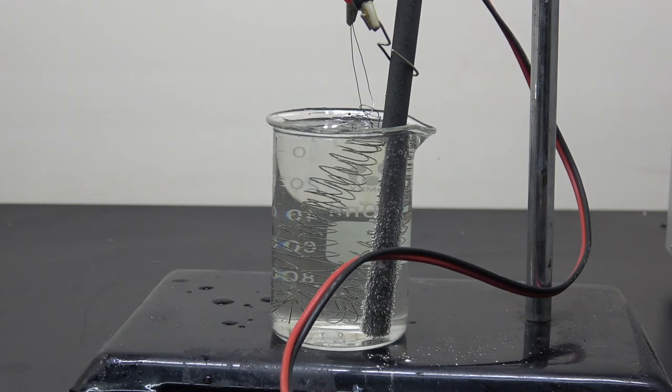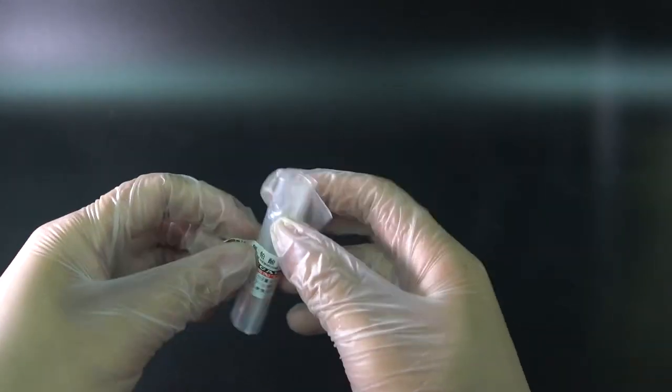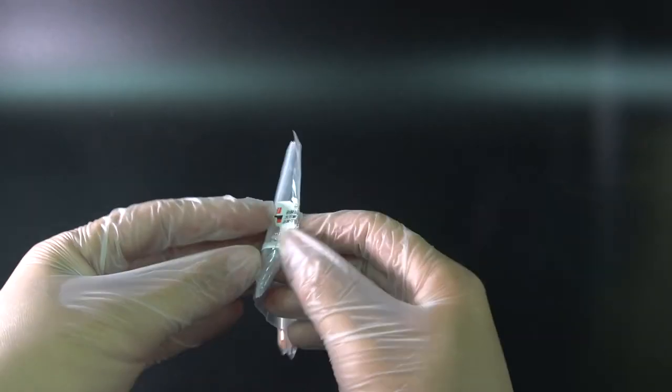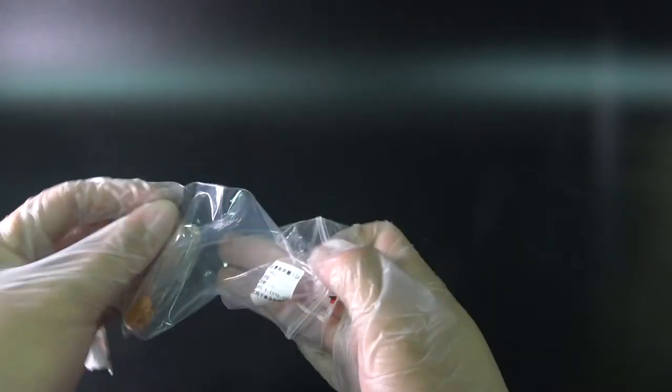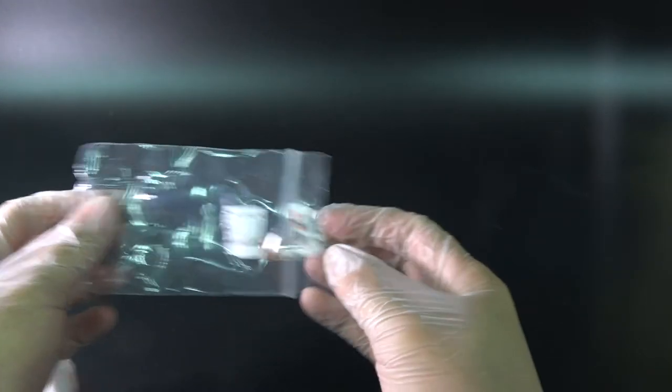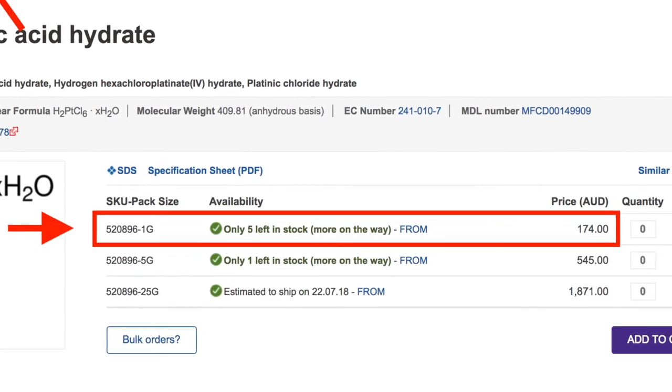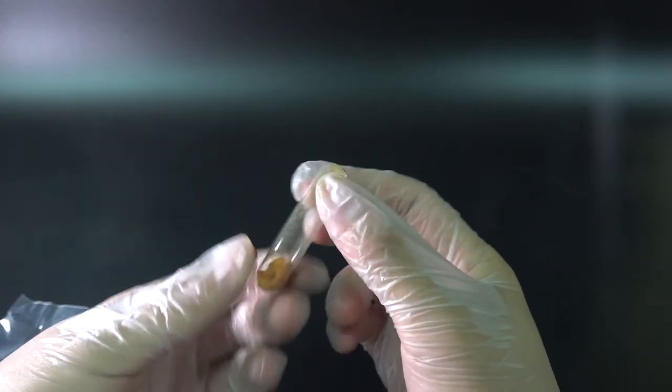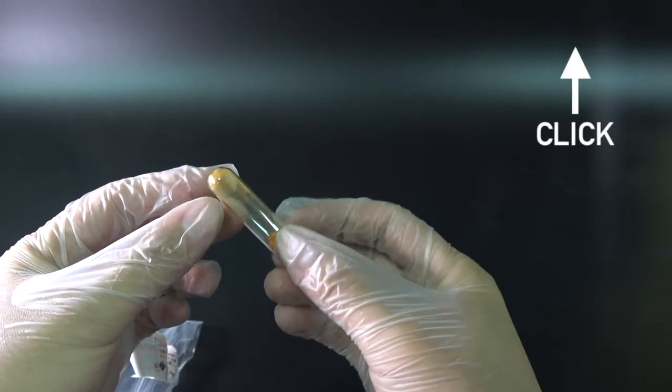While the electrodes are being cleaned, I figured I should prepare the hexachloroplatinic acid solution. Hexachloroplatinic acid hexahydrate is a reddish-orange solid at room temperature. By the sophisticated package for just a single gram of the chemical, you can probably tell this thing is not cheap. And it is not. Here is a general idea how much it would cost for just a gram of the chemical. This is also the reason why keeping this channel running is pretty expensive. If you are feeling generous, please consider supporting me on Patreon. I really appreciate any of your support.